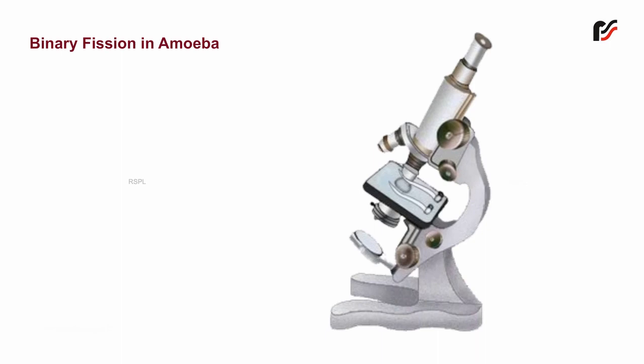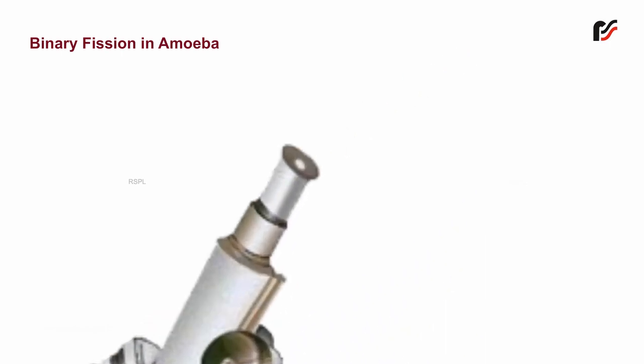Set up a compound microscope. While looking through the eyepiece, adjust the mirror and diaphragm so that the microscope is illuminated. Now place the slide on the stage and focus at low power. Observe it.